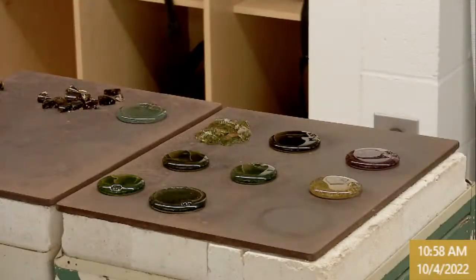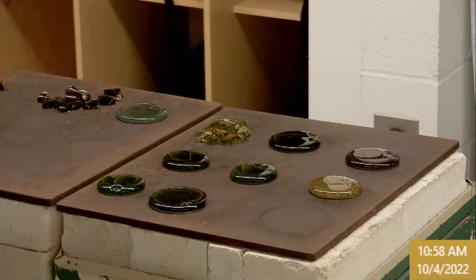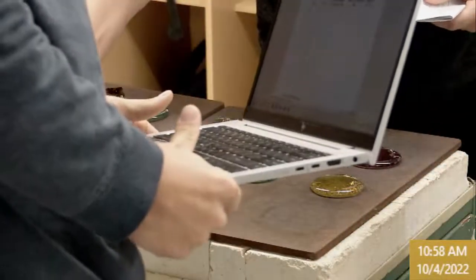You'll still want to take measurements of the whole group. Everyone's going to report everyone else's glass, and for this, we're not going to know the diameter, but we can approximate the viscosity during the pour based on the others, based on the video. And also, if you want to check out the light table to see what internal stress looks like, we'll put plastic parts on here to begin with, just so you can see internal stress in plastic, just like you can in glass. You've got to look from the top. And there could be some glass shards on the floor, so do still be a bit careful.